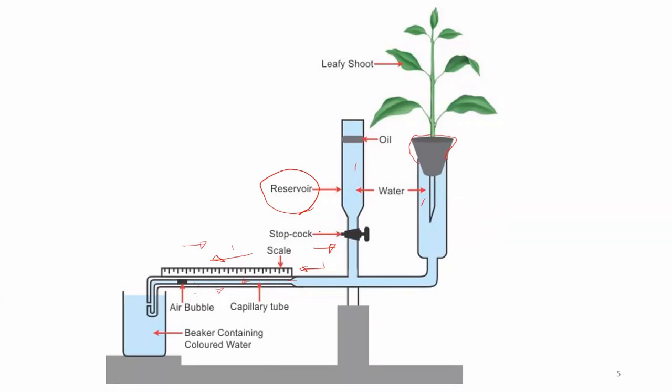So to avoid evaporation affecting the reading, we can smear Vaseline on the environmentally open areas. In here, we place some oil. Through the oil, the water can't evaporate. So on the open areas, we can apply an anti-transpirant agent like Vaseline, oil, or grease.